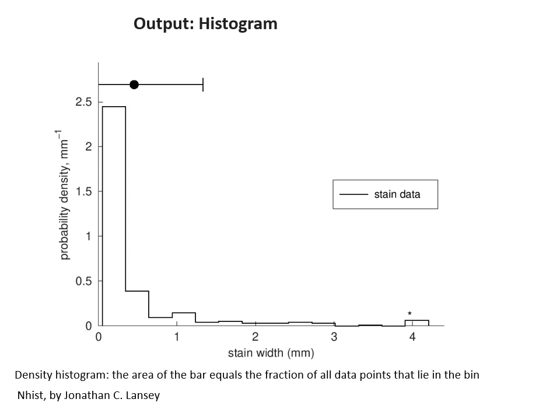And the software groups the stains into bins. So you see the first bin is the highest, and it has the stains between about 0 millimeter and 0.3 millimeter. So this spatter has a preponderance of stains that are in that range of size.